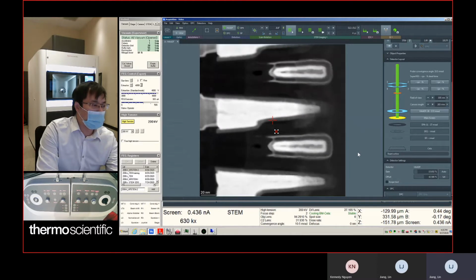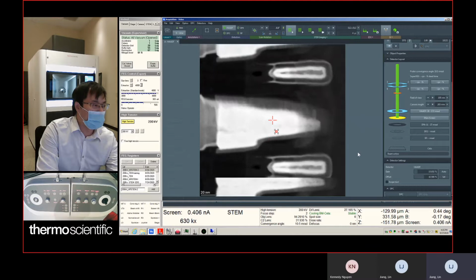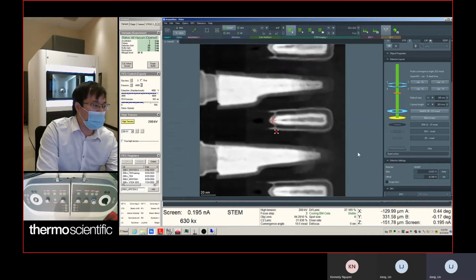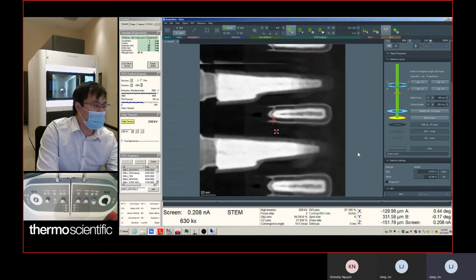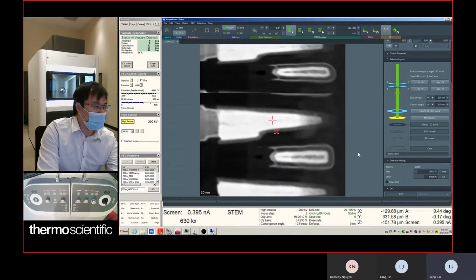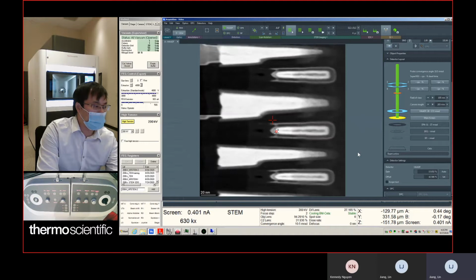So we can do compressing. 195 is the magic number. Okay. Go here.